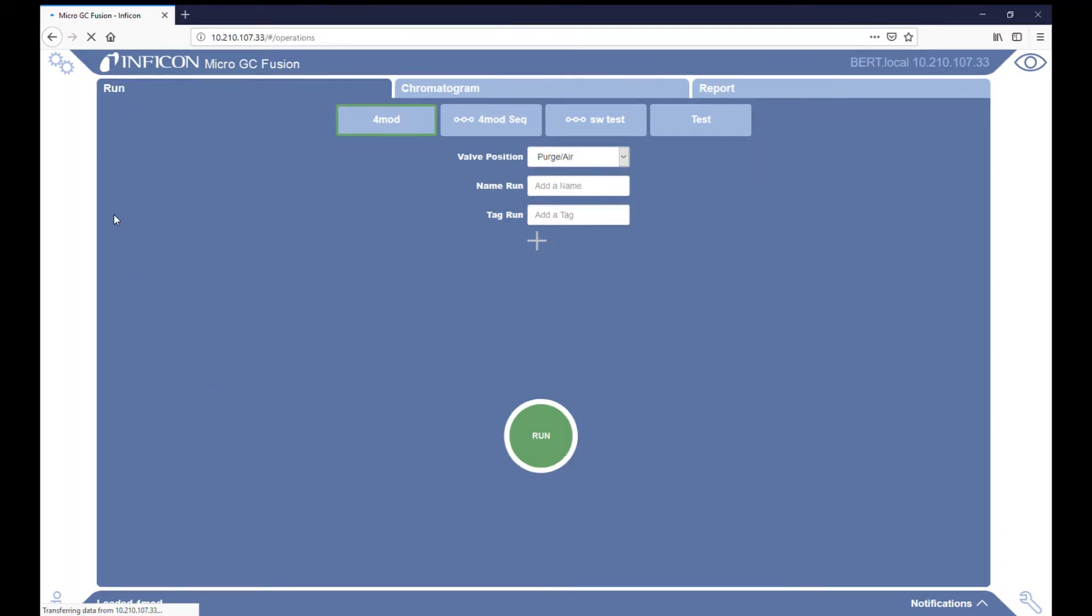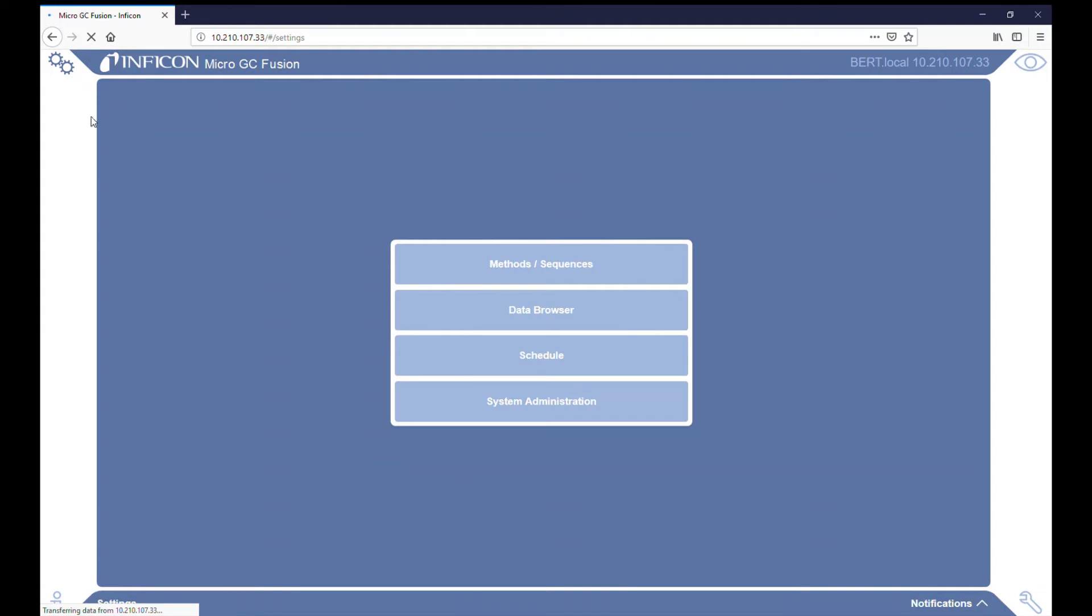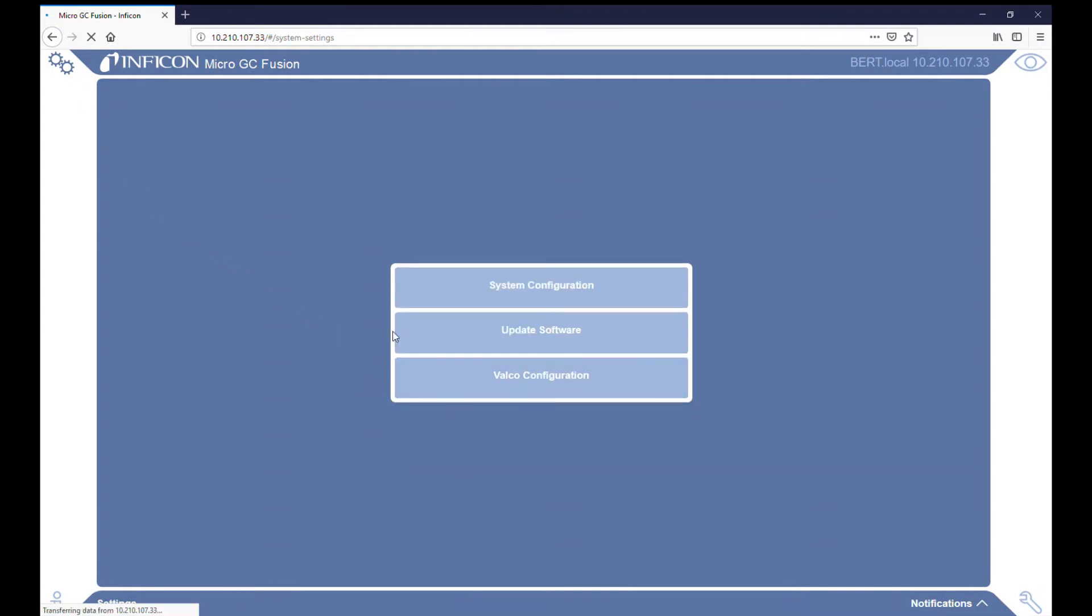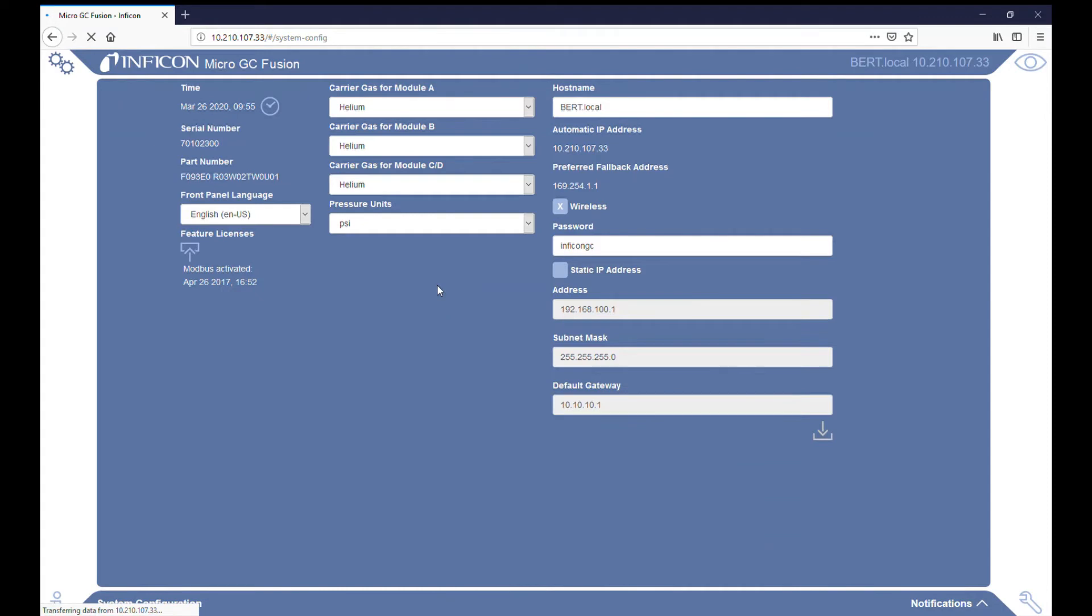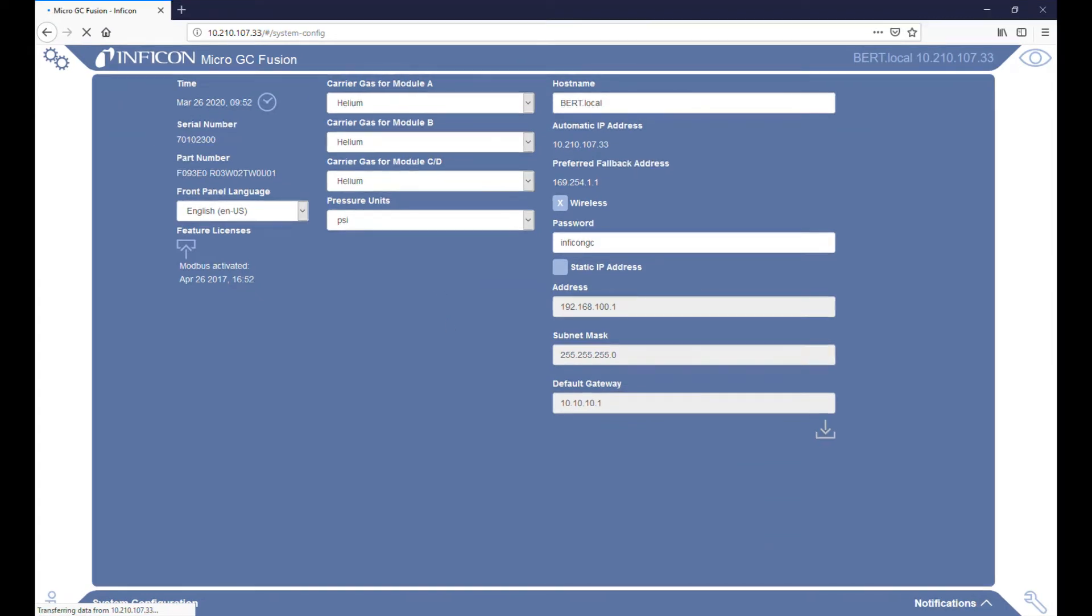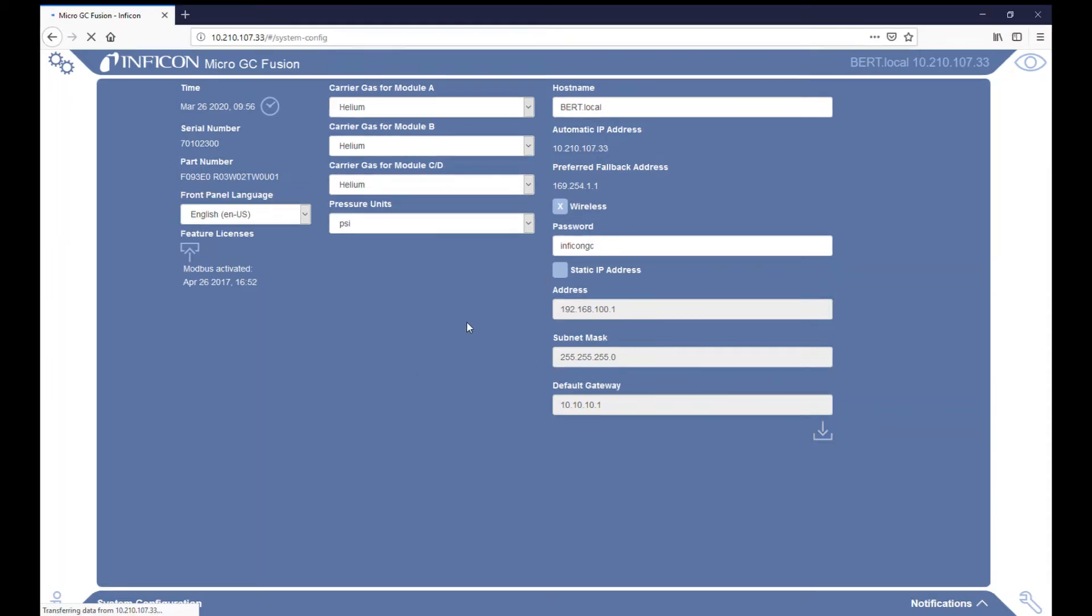To change the IP settings, first click the gears icon in the upper left-hand corner. Next, click System Administration followed by System Configuration. You will see a checkbox labeled Static IP Address. When this box is checked, it will use the IP address listed below.